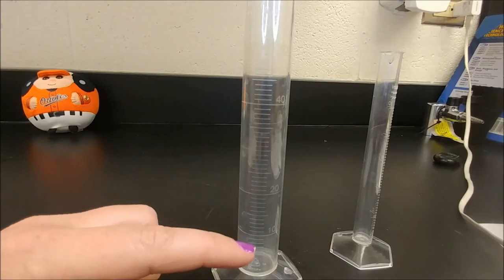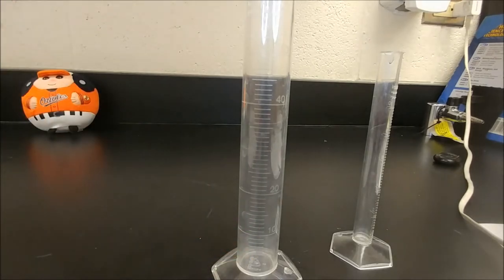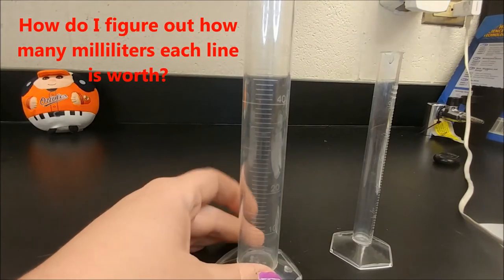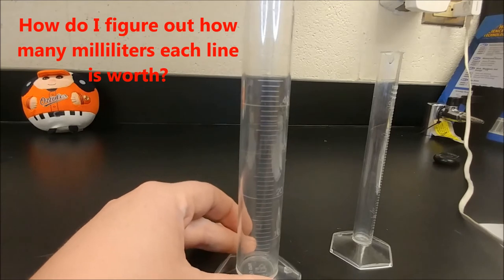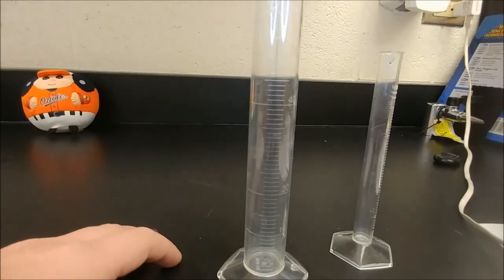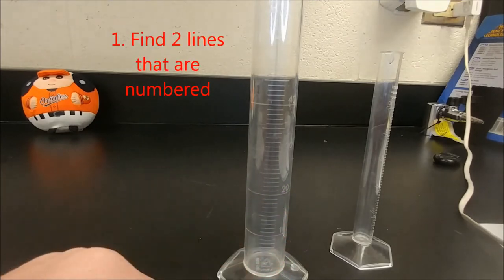Sometimes we have to figure out how much each line is worth — sometimes they're worth two, sometimes they're worth one milliliter. Usually the graduated cylinder will tell you at the top, but if it doesn't, you may have to figure it out. So how do we do that? The first thing we do is look at what the two numbers are that are closest together.